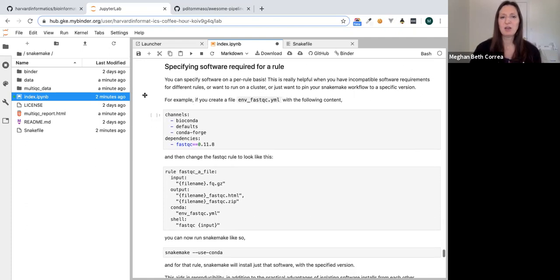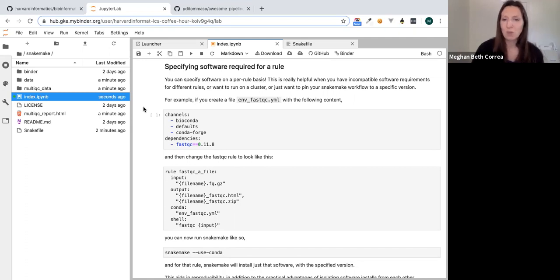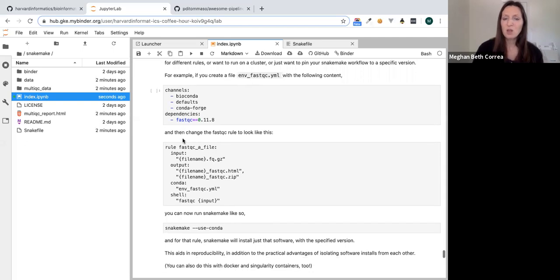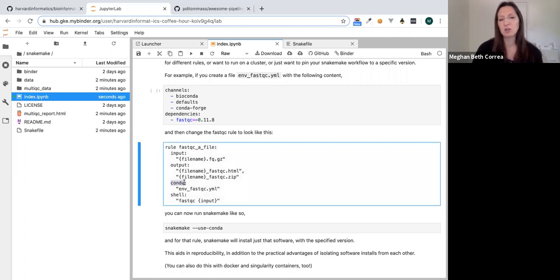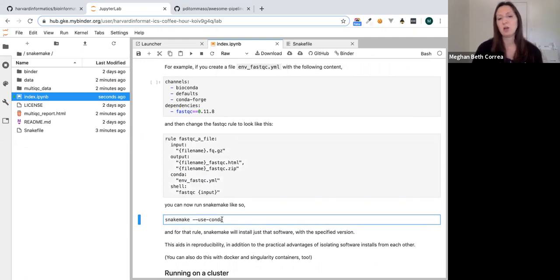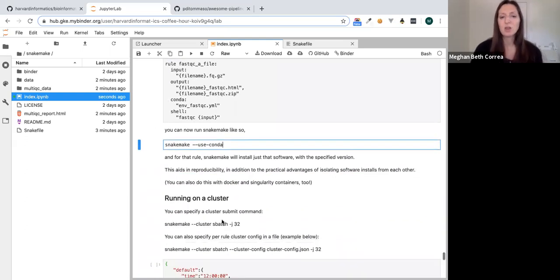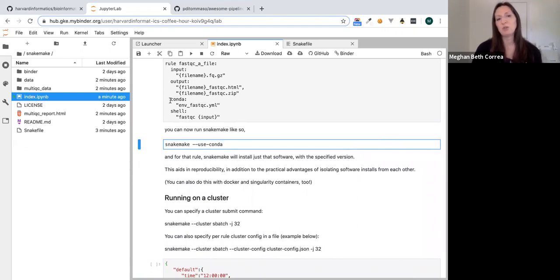You can specify software to install per rule rather than bundling everything into one environment. You do this by specifying a YAML file with dependencies — for example, env_fastqc.yaml — and adding a 'conda:' section to your rule pointing to that file. When you run Snakemake with the --use-conda option, it installs those dependencies only for that rule. Similarly, there's a --use-singularity option allowing you to specify a Singularity image for a specific rule. Docker containers can also be used as Singularity containers.